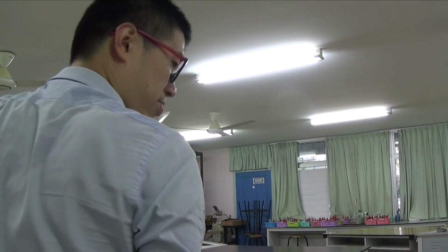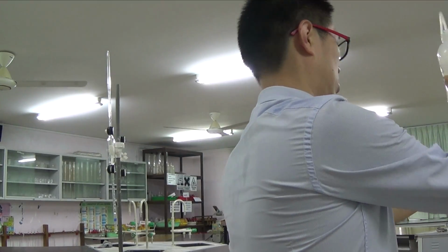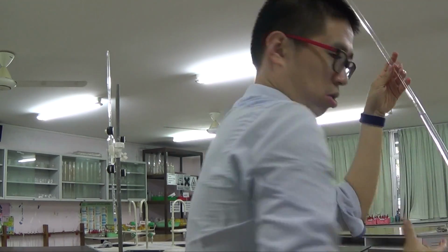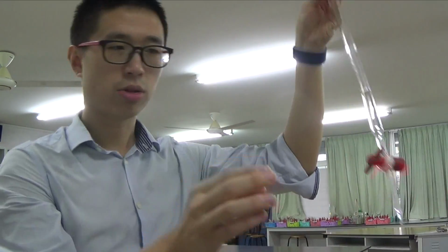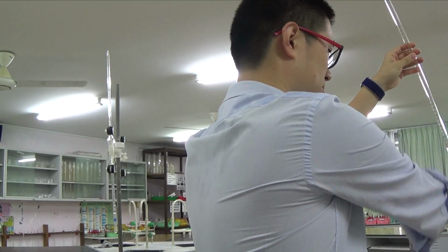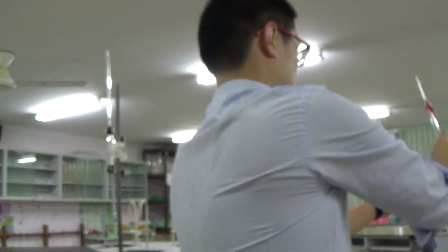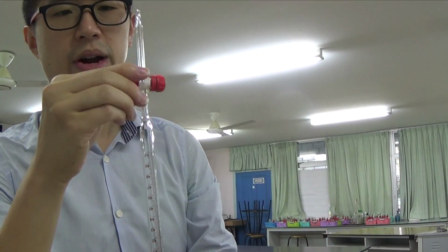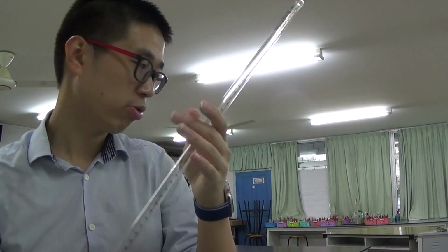Okay, now I'm just going to quickly rinse my burette. By closing the tap at the bottom so that it doesn't leak, I'm going to roll it around. But remember to always open the tap to allow a bit of distilled water to run through for your washing. And remember, you have to wash your burette with the solution that you're going to fill it with later on as well. So that's it really on the initial rinsing part.